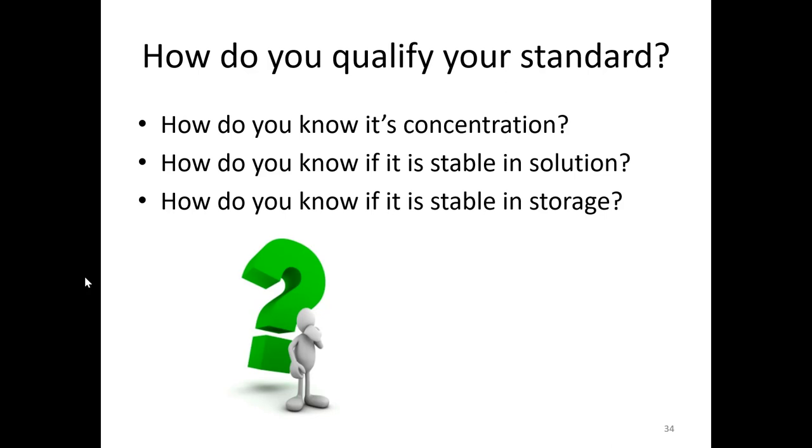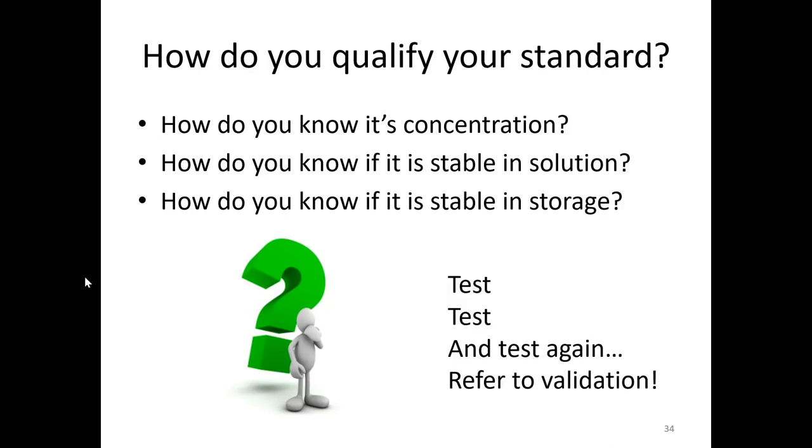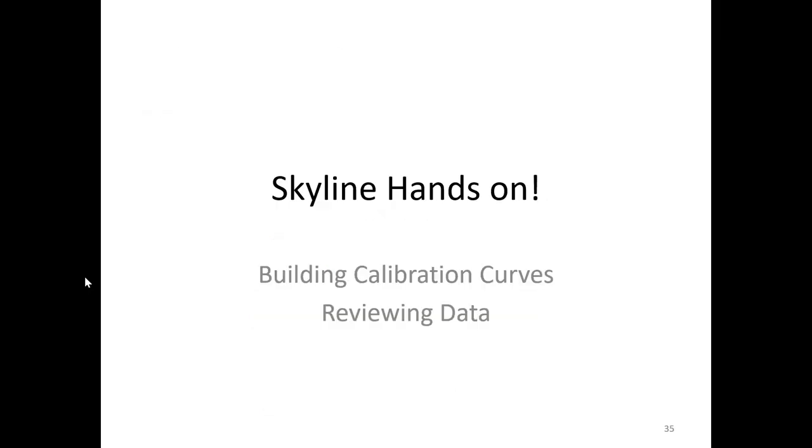How do you know if it's stable in storage? These are things you can test for. So you can look at changes over time, which is a lot of what reproducibility and repeatability address. So the point is test, test, and test again, and then refer to validation.